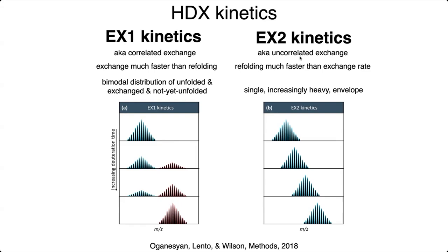So every time the protein kind of breathes, it's kind of weird to think about a protein breathing. You're like, a protein doesn't have lungs, but a protein is dynamic. So even though we think about it as sort of like a static thing a lot of the time, one of the great things about HDX-MS is that it's allowing you to see the dynamic nature of the proteins. And one thing that the proteins do is they kind of breathe. Now, when they breathe, this doesn't mean that they're totally unfolding or anything.